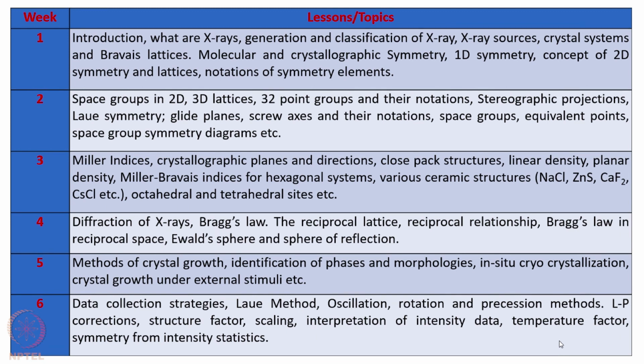And then we will move to Bragg's law for X-ray diffraction, the reciprocal lattice, the reciprocal relationship of Bragg's law in reciprocal space, Ewald sphere and sphere of reflection. Then we will move to the second part of this course, where we will discuss the methods of crystal growth, different ways to modify crystal structures and crystal growth under external stimuli.